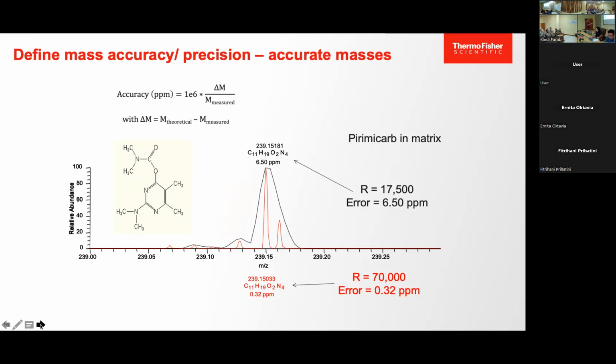Okay. So this is how the resolution is going to differentiate. So that's my title of today: resolving what was hidden. If we were discussing this about 20 years ago, we didn't have this technology, so you would always detect as one peak. So the camera now becomes more precise, higher megapixel. So now you can detect at higher resolution, and you know that it's actually not a single peak. It's two peaks. So, yeah. Next.